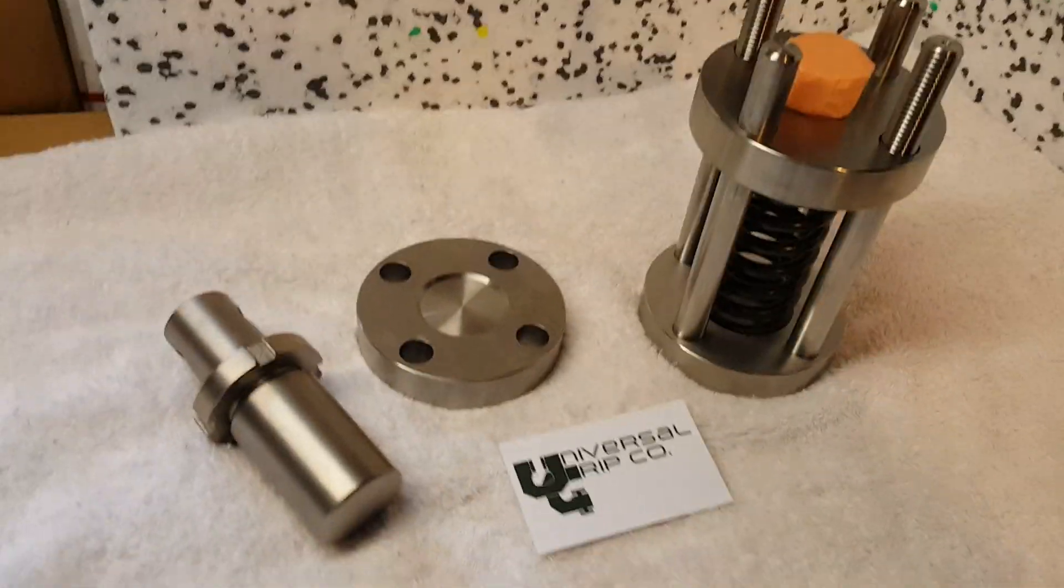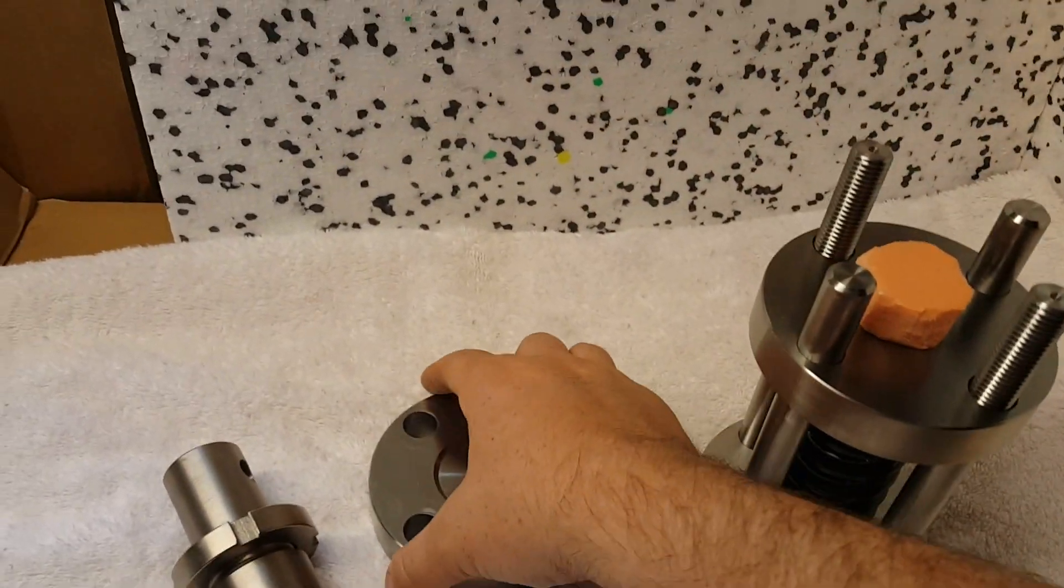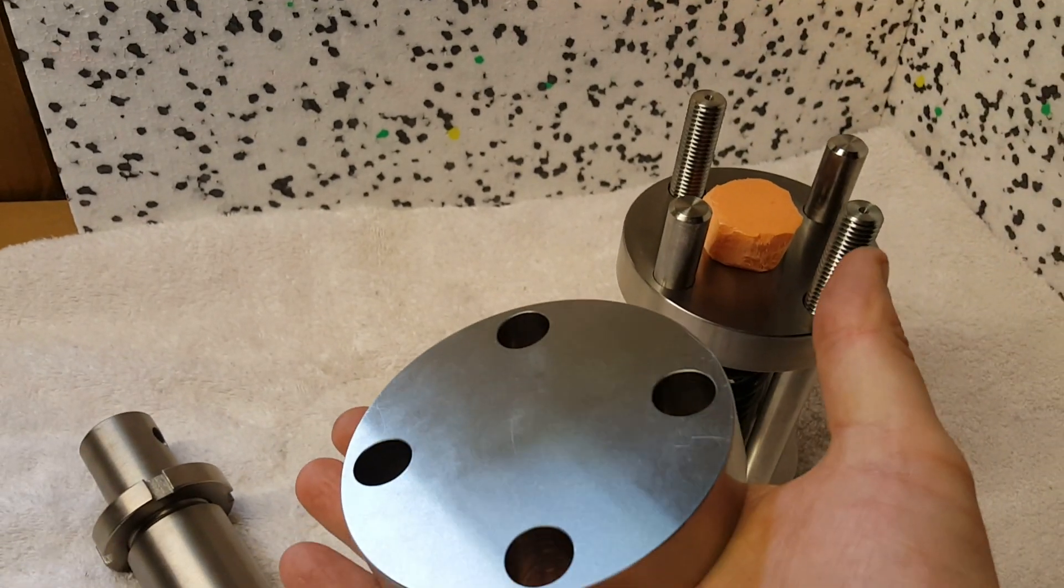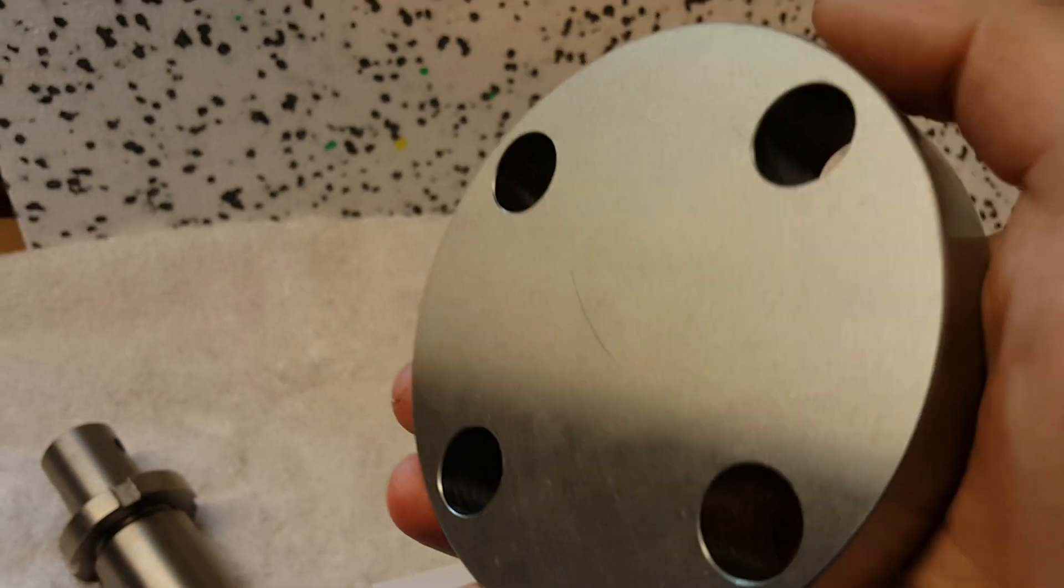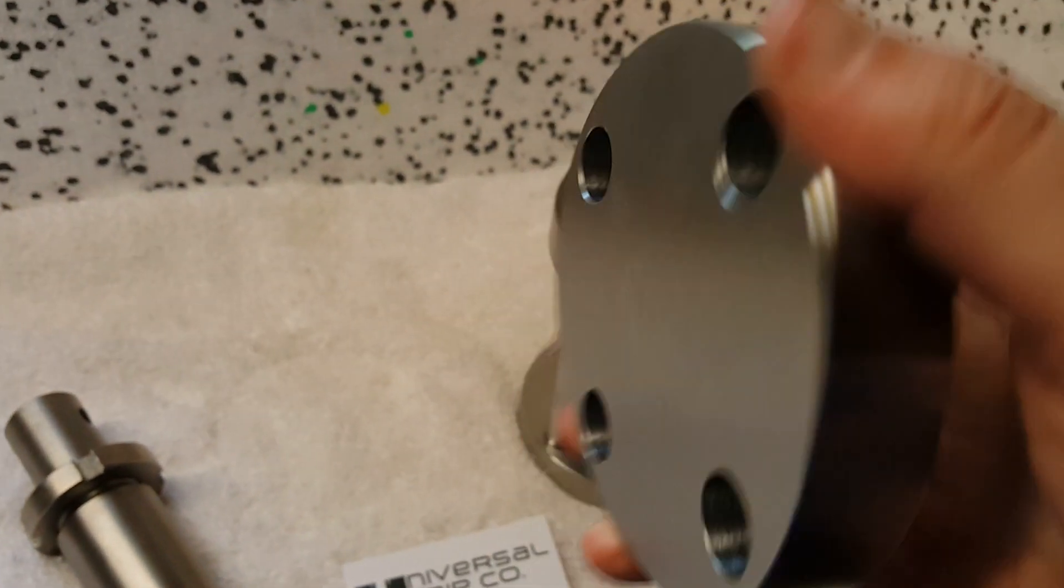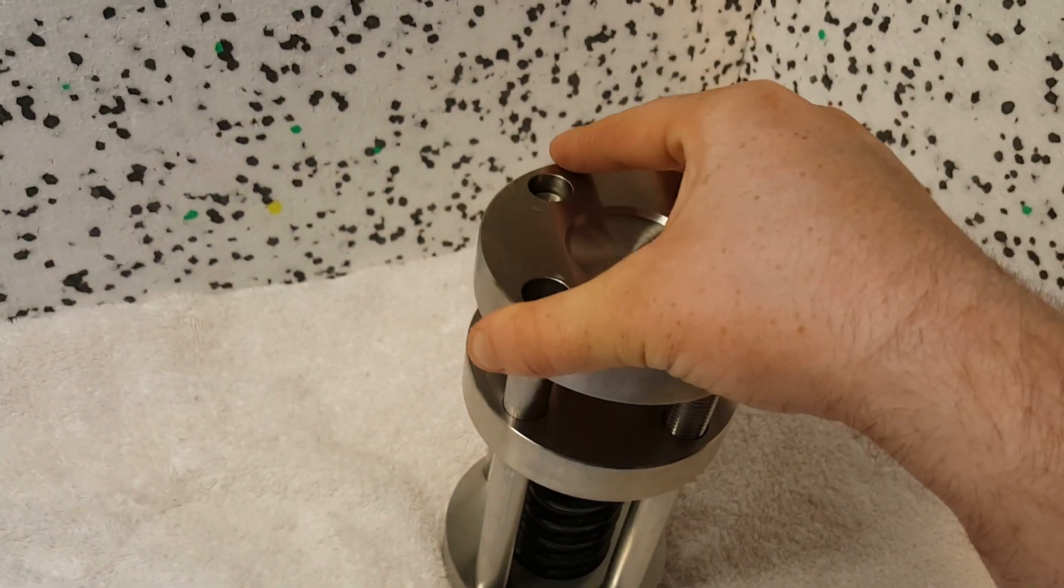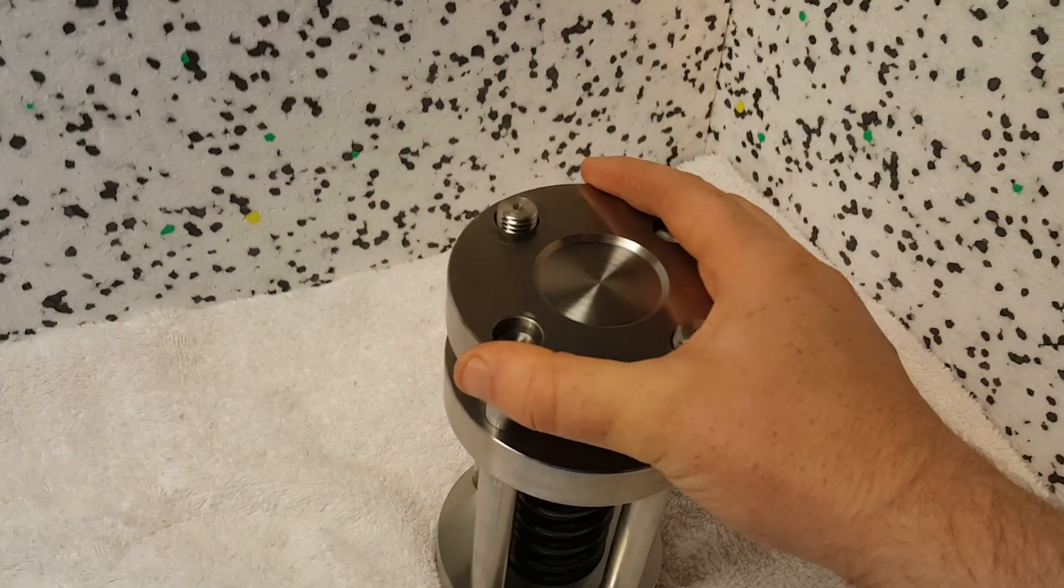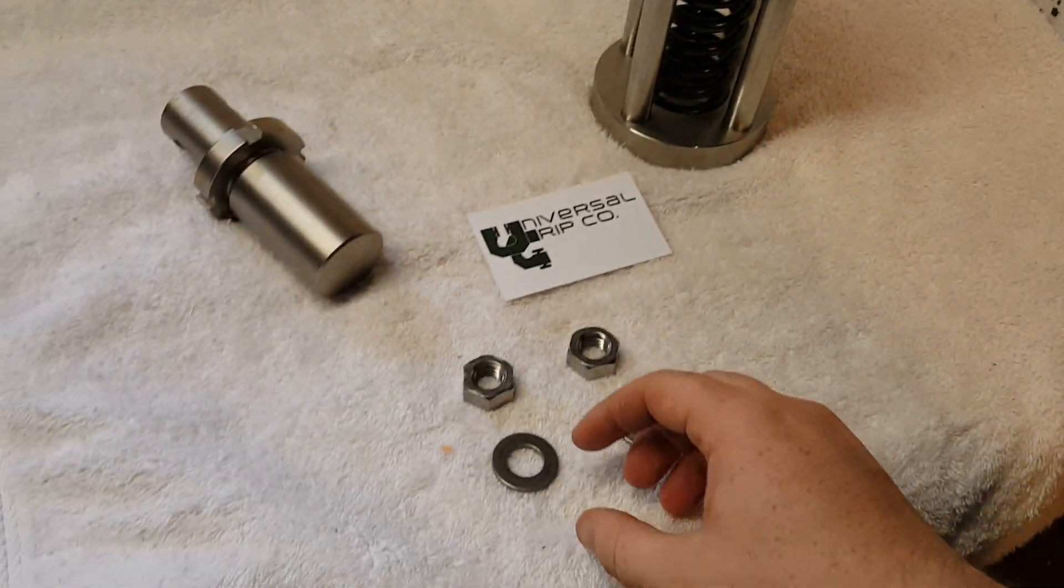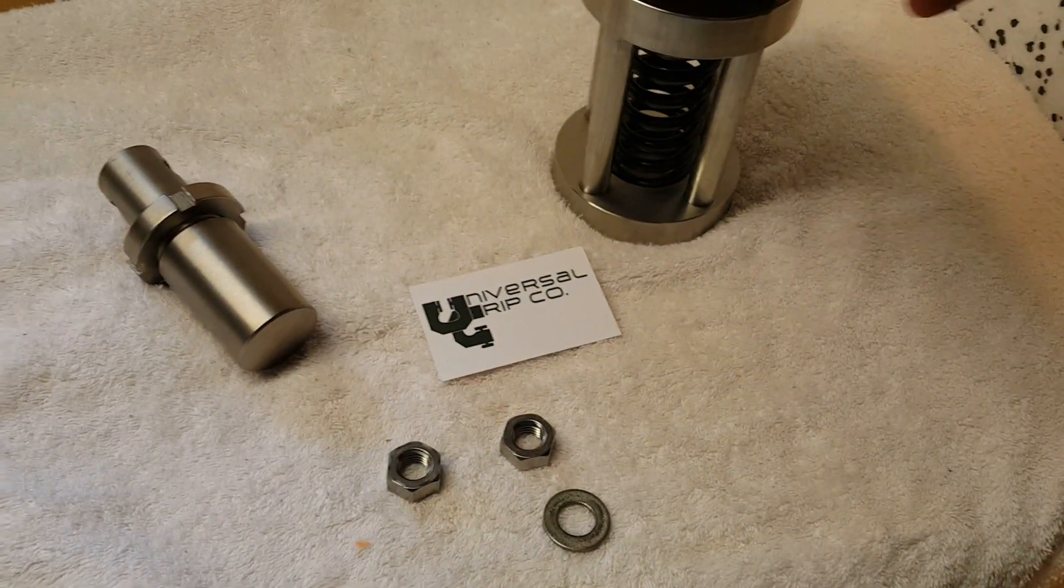You also have a constant amount of strain through these compression platens here. This is the top platen with the smoothened surface. This just mounts right onto the top here.